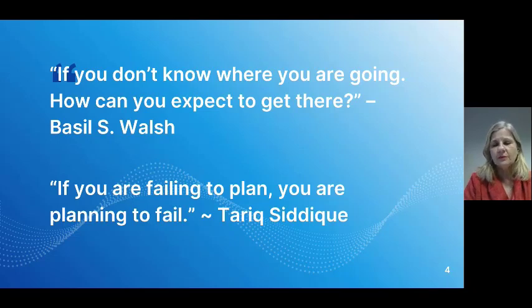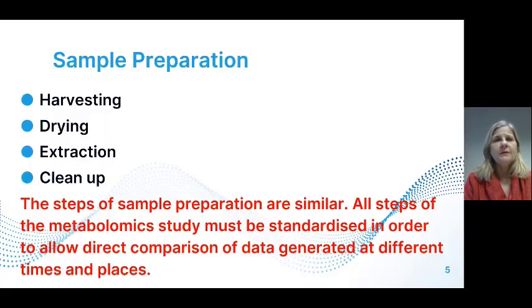And this is very important with your sampling, because if your sampling step is incorrect or your sample handling is incorrect, you will not be able to get the data that you require.